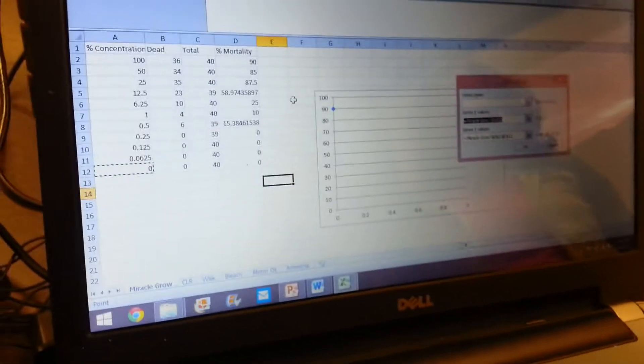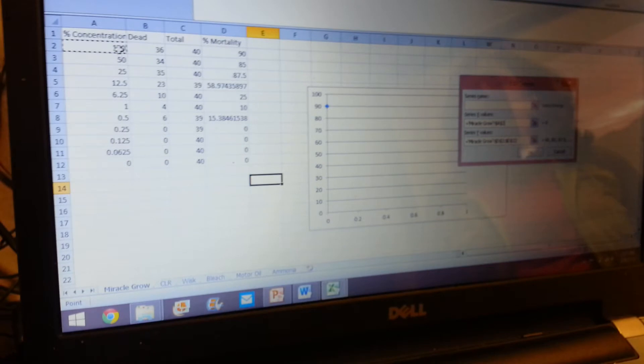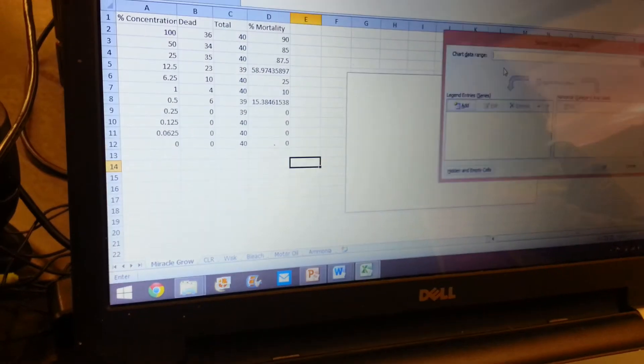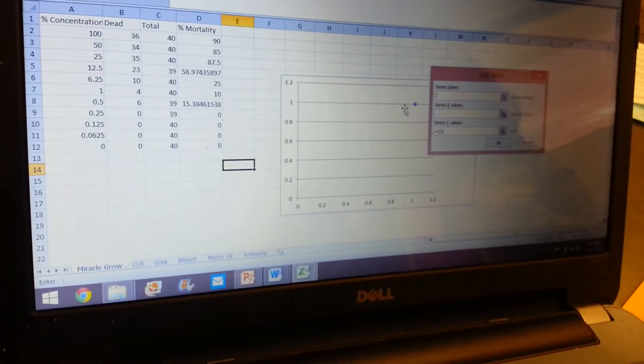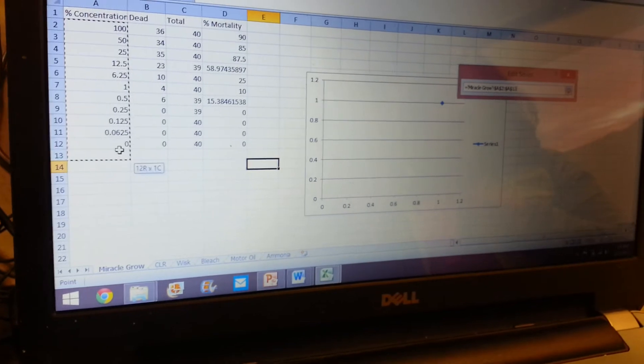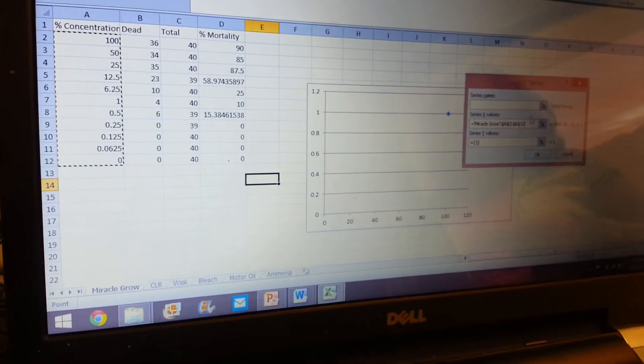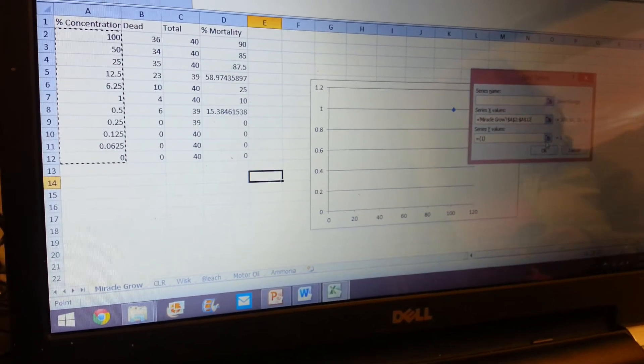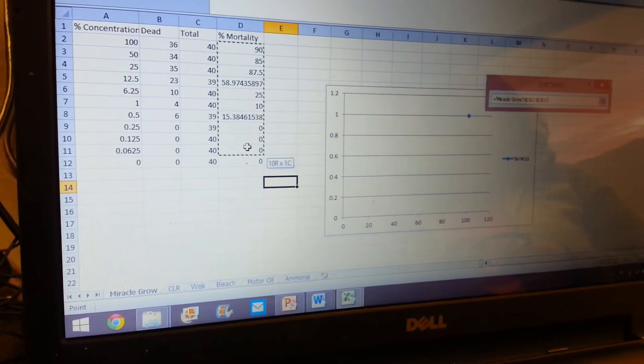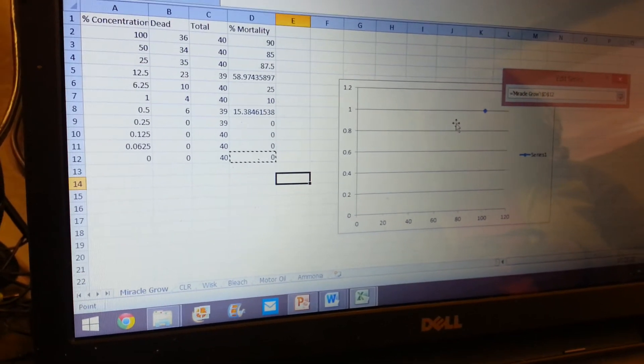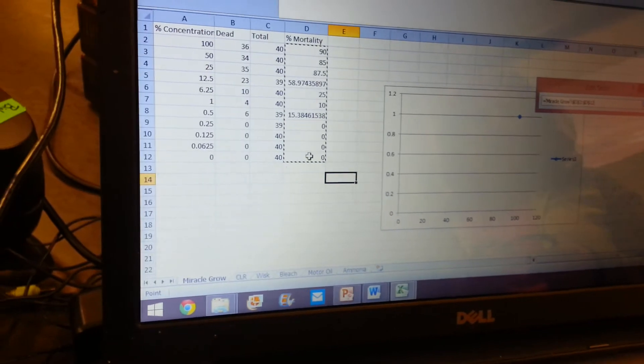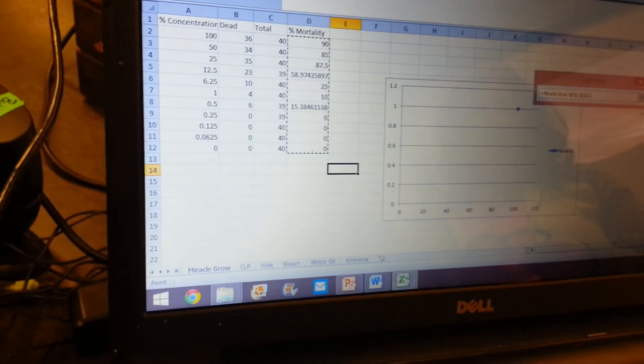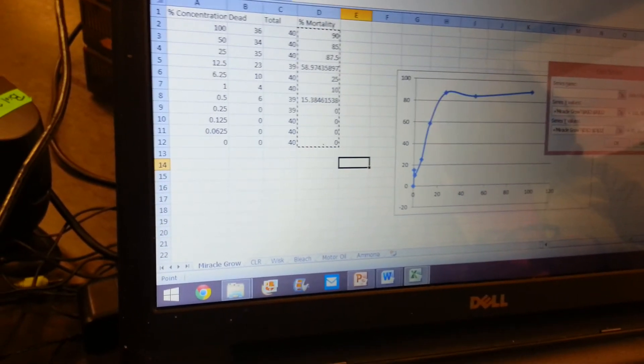So how do you do two at one time? So if I want to do two pollutants on the same graph? All right, so now you just go Add. And you go Select Data, and then Add, and then you select your X series, which is going to be your concentrations. And then you're going to select your Y, and you do percent mortality. Remember, not total, and you want to make sure sometimes it will—that's all right.